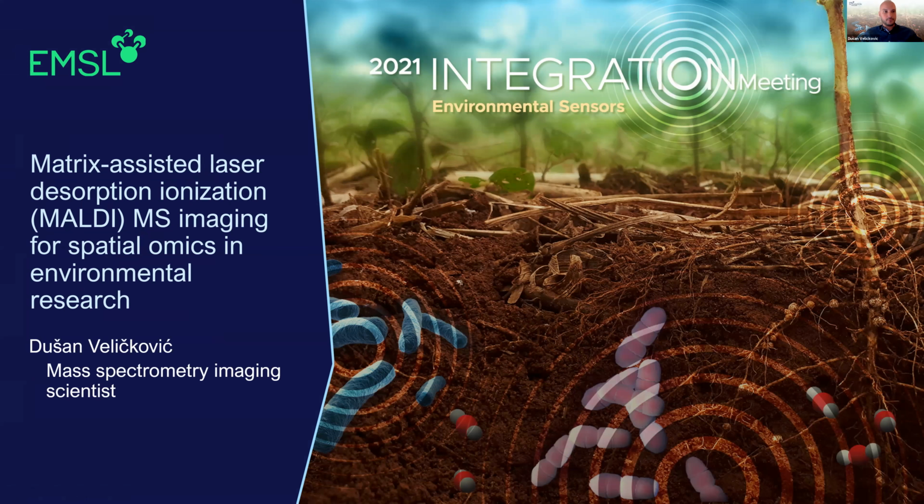Thanks, Amir, for the introduction, and thank you all for joining this tutorial. This part of the tutorial will be dedicated to probably the most employed molecular mass spectrometry imaging tool at EMSL, and it is matrix-assisted laser desorption ionization, or MALDI, mass spectrometry imaging.